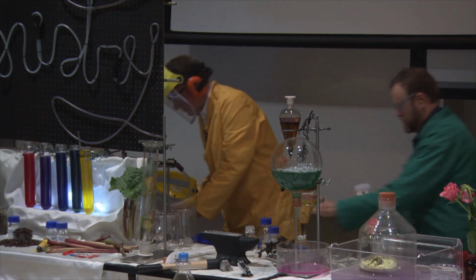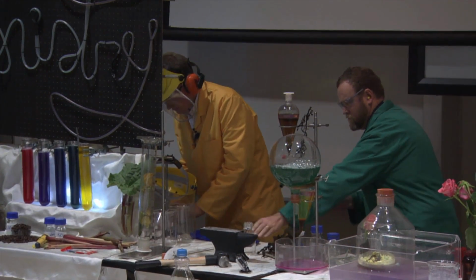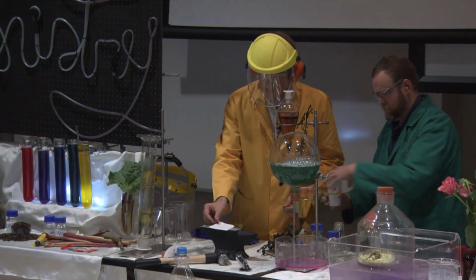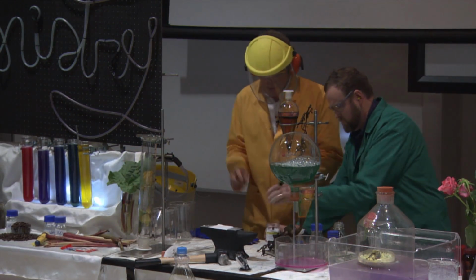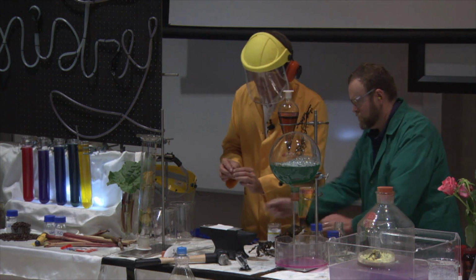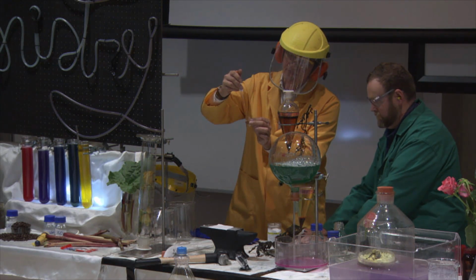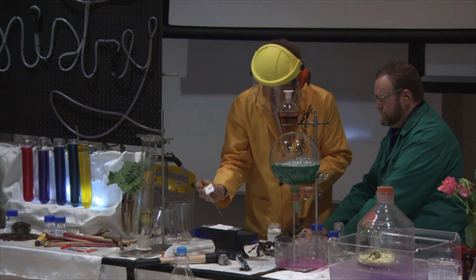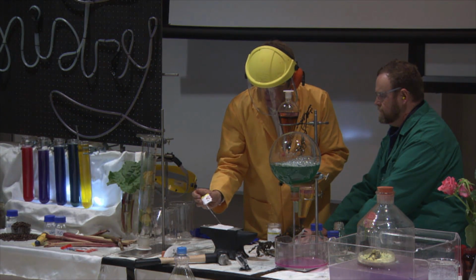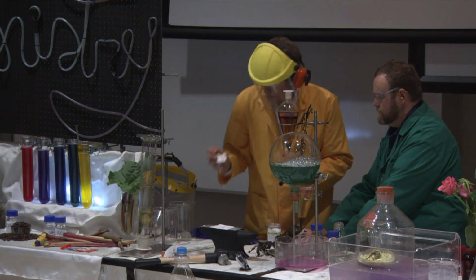And I'm just going to get a piece of paper. I'm just going to put my paper down there. So this is my nitroglycerin. That's okay, I'll just leave it there, thanks. This is my high explosive, my nitroglycerin. Just a tiny, tiny drop, just a few drops. Put it onto the paper that's just sitting there. Okay, hardly any at all.